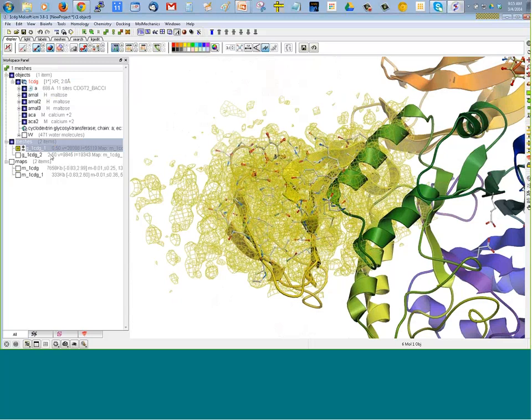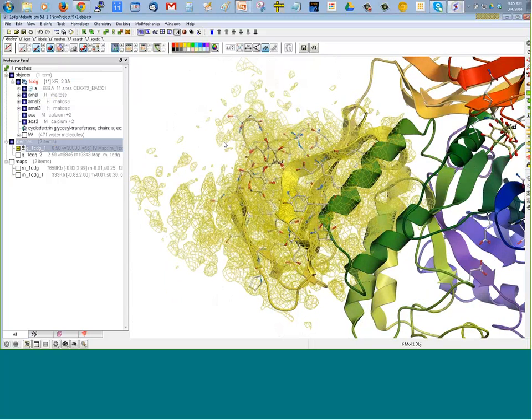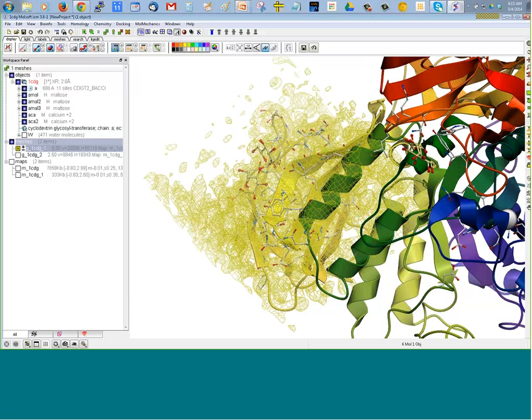Okay. So this is also another useful tool to use before undertaking structure-based docking or screening, because you can check how much of these residues the crystallographer has actually seen. And in this case, it's pretty decent. It's a 2-angstrom resolution structure.